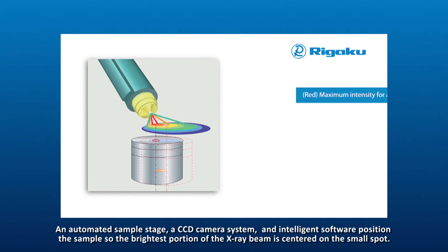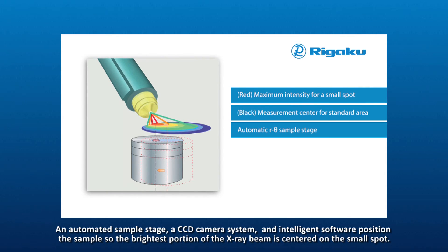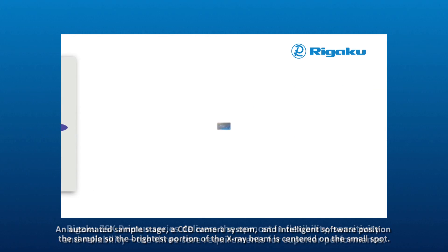An automated sample stage, a CCD camera system, and intelligent software position the sample so the brightest portion of the X-ray beam is centered on the small spot.